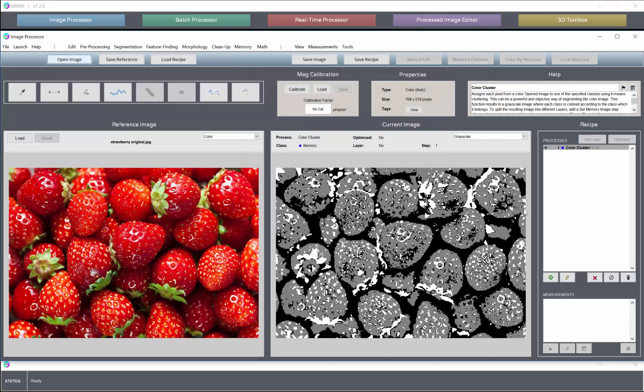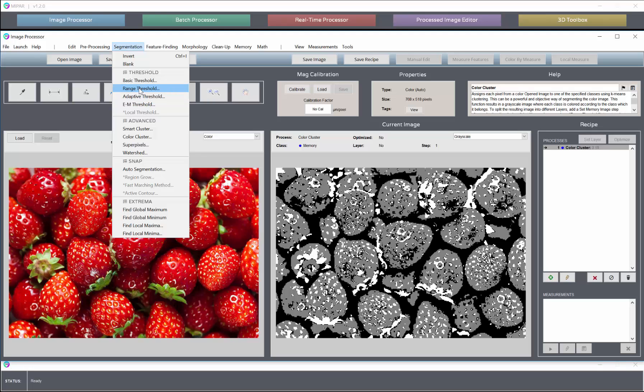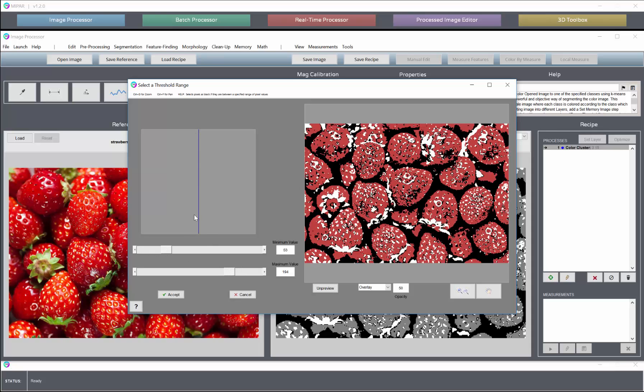Now the output, as we saw before, is a grayscale image where we can go in with a threshold tool to select one or multiple classes. And we're going to want to use a range threshold to grab this center class, class number two in this case.